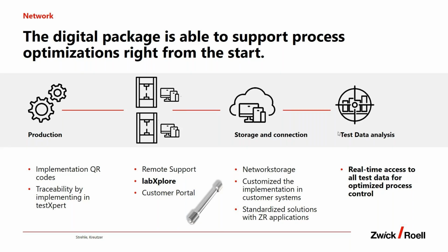You can connect QR codes to get data into your system, or combine, let's say, organization data with your testing data. We have this traceability functionality implemented in testXpert, which is very important for all the medical and pharmaceutical companies to prove who was doing what, why, and when, according to these FDA regulations.